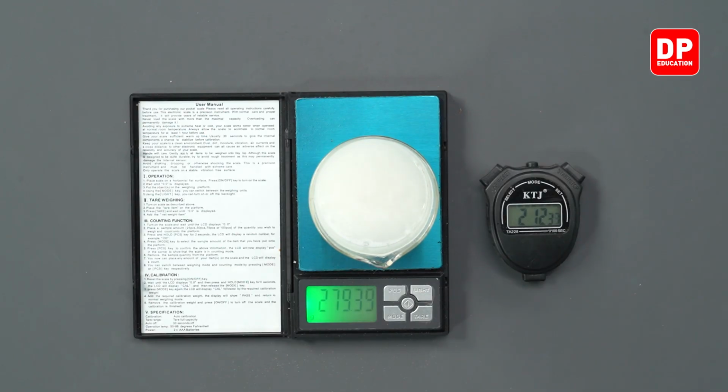And then we have our seventh reading. It's going to be 279.36 grams. Then we move on to our eighth reading. Eighth reading is 279.23 grams.